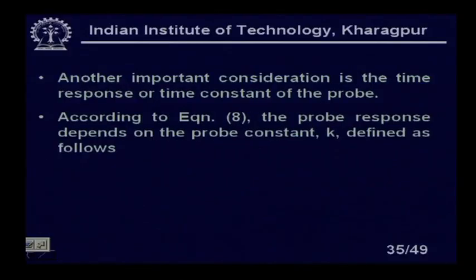So, you do not need very fast sampling. You can measure only every 6 minutes, 10 minutes, but still, you must consider the time constant, or the response time, of your DO2 probe, right. These are important issues, or important parameters, of a probe.